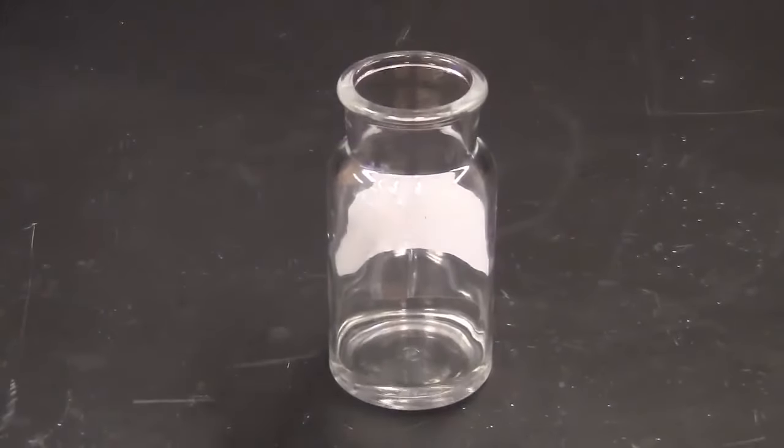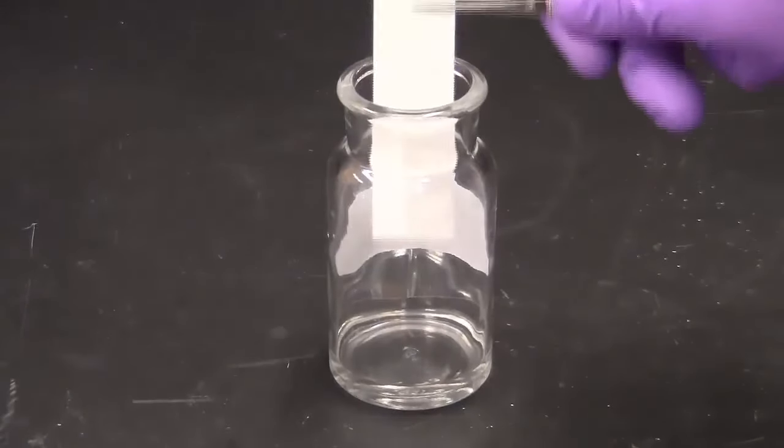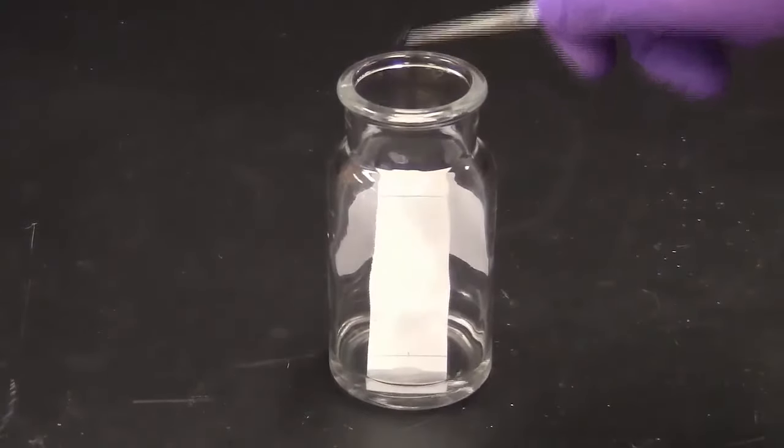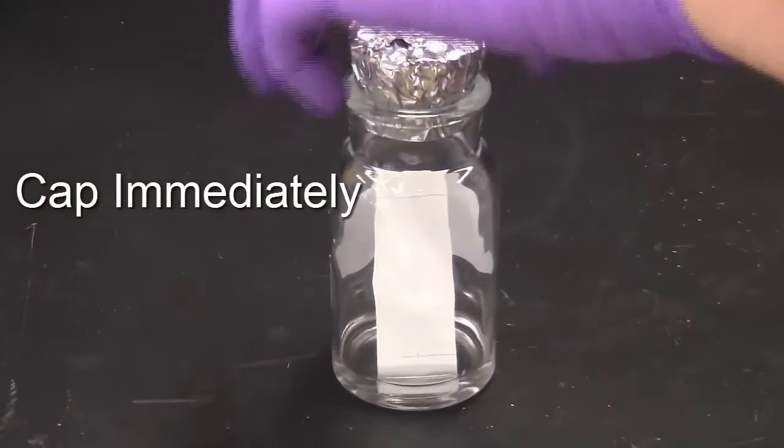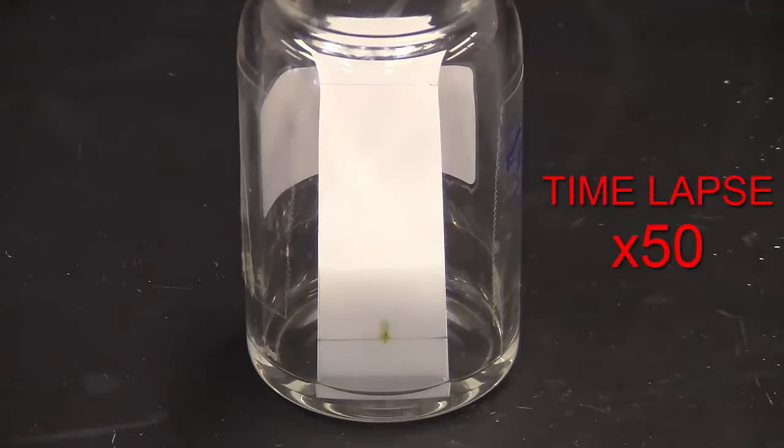Use forceps to place the TLC plate into the developing chamber. Cap the chamber immediately. The solvent will move rapidly up the plate. If you cannot see the solvent line, try shading the chamber with one hand.